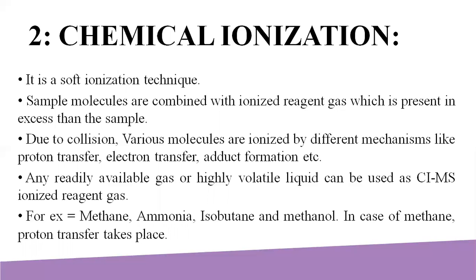Any readily available gas or highly volatile liquid can be used as the CIMS ionizing reagent gas. For example, methane, ammonia, isobutane, methanol. In the case of methane, proton transfer takes place.